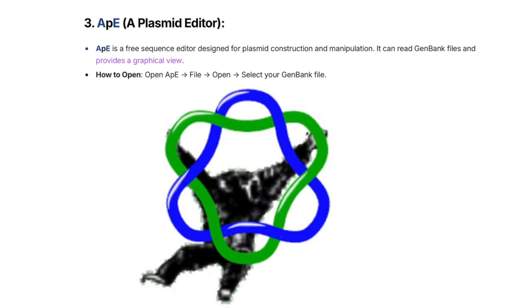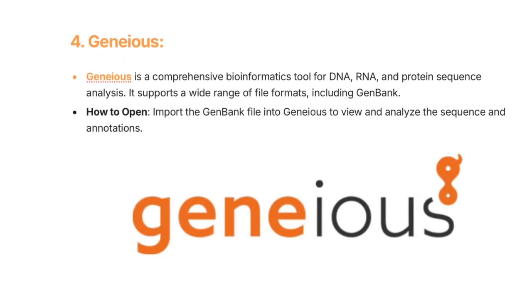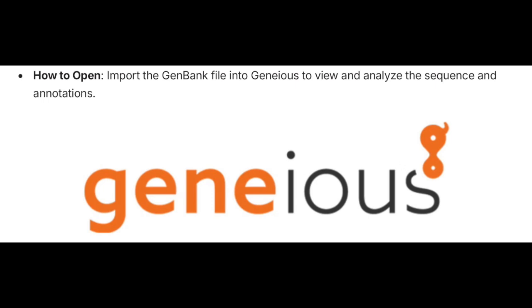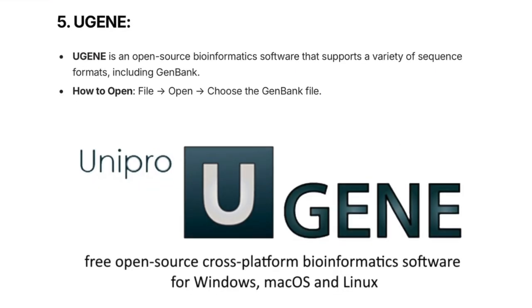Another well-known visualization tool is the Plasmid Editor (APE). The Plasmid Editor is a free sequence editor designed for plasmid construction and manipulation; it can read GenBank files and provide a graphical view. Go to File > Open and select your GenBank file. Another tool is Geneious — a comprehensive bioinformatics tool for DNA, RNA, and protein sequence analysis that supports a wide range of file formats including GenBank. Importing a GenBank file into Geneious allows you to view and analyze the sequence and its annotations.